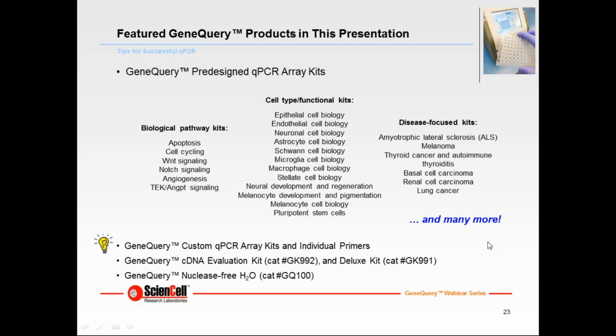Okay, how can qPCR efficiency be over 100%? It's a good question. So when you're calculating qPCR efficiency using a serial dilution curve, if you have PCR inhibitors, then your standards are off, basically, and that's how you end up with over 100% efficiency.